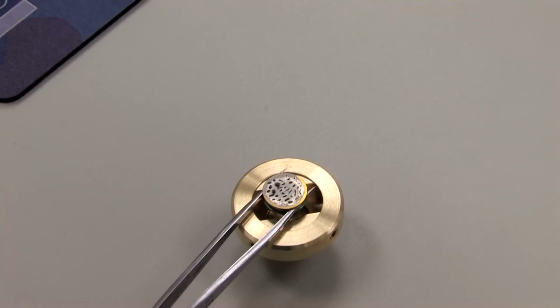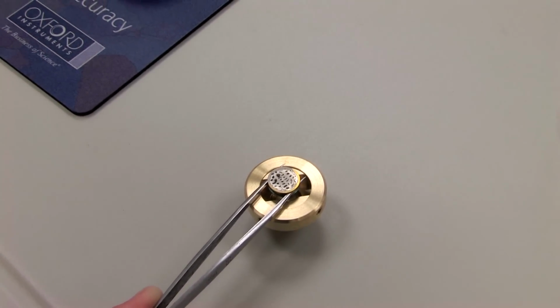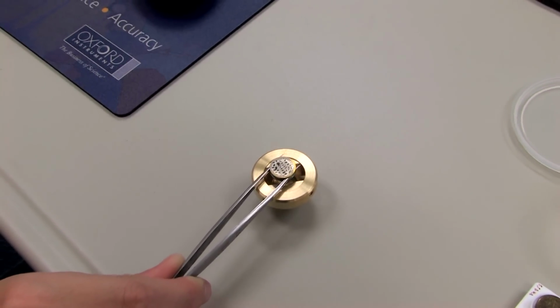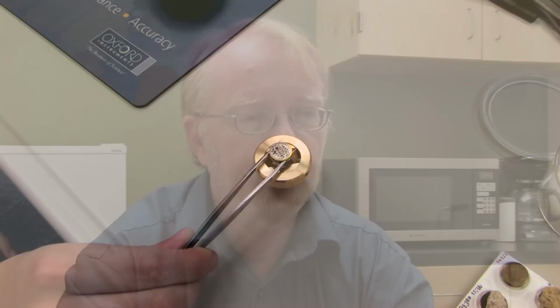Basically, what they do is coat the sample with gold and sometimes even with palladium, and it makes the sample conductive to the electron beam. And then they load it into the scanning electron microscope in a high vacuum chamber so it doesn't scatter. You don't have air molecules to scatter the electron beam as it's being focused on the object. So again, you can get really tiny focuses on things that you have in the SEM.